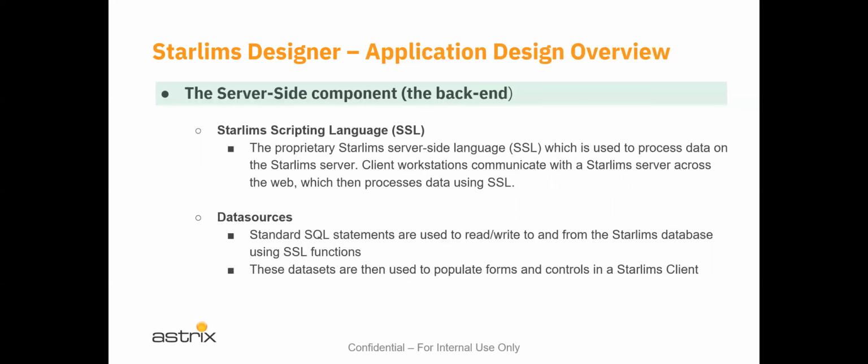On the server side, we have this STARLIMS scripting language, otherwise known as SSL. It'll always be referred to within the server STARLIMS environment as SSL. And that is a proprietary STARLIMS server-side language, and we do all of the processing of the data on the STARLIMS server. It doesn't occur anywhere else.